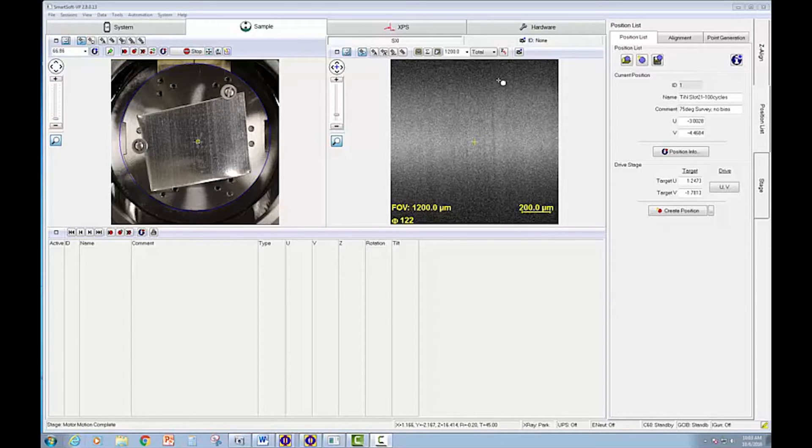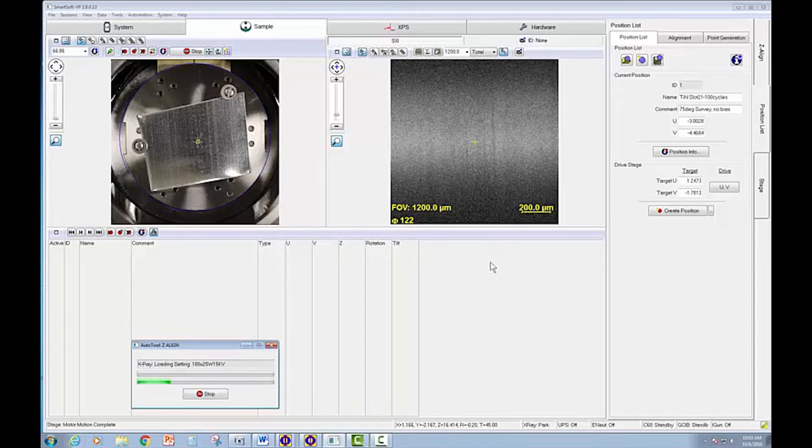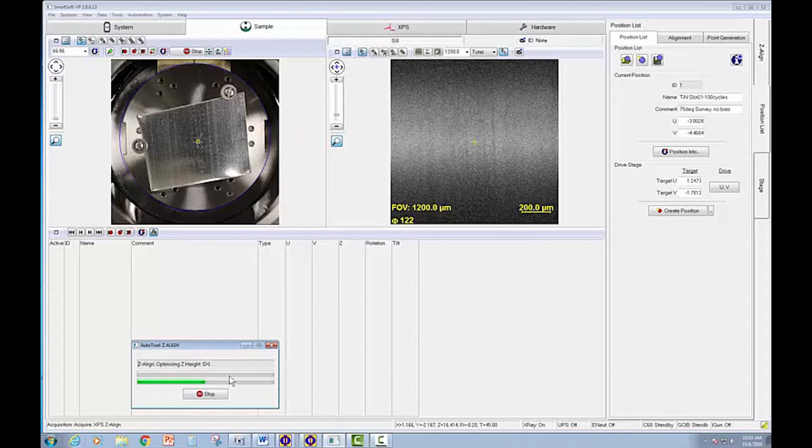Initially, we're going to perform a Z-align to find the correct sample height, and you'll see that's starting now. It's loading an X-ray setting and then starting to adjust the Z-height.